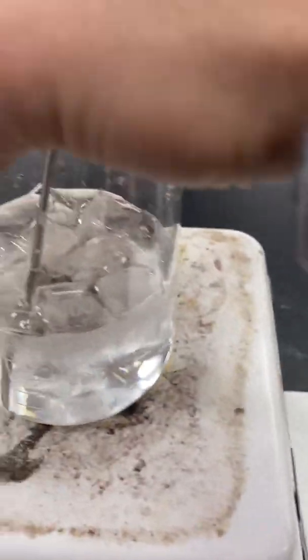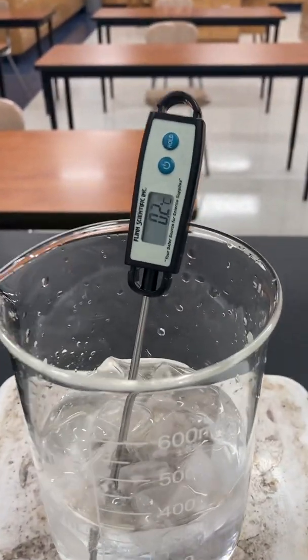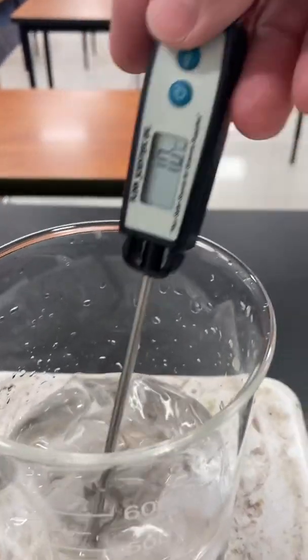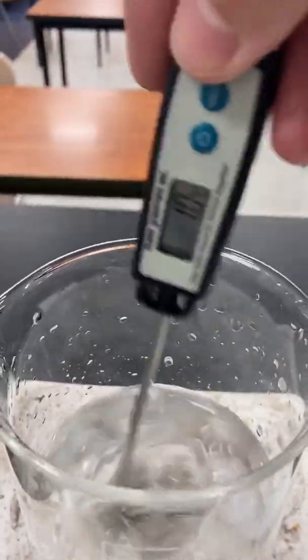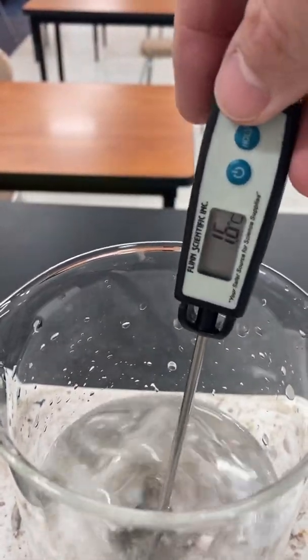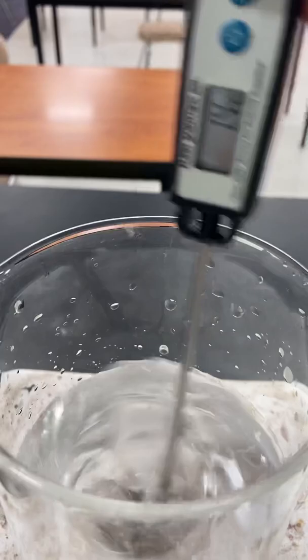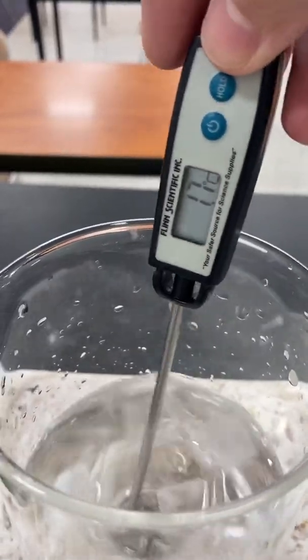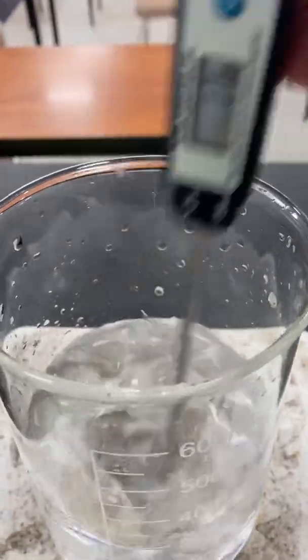So let's put this beaker of about 300 milliliters of ice water on, and the 300 is really not going to come into play today because we're not doing calculations. And let's see what happens. So at time 0, we had 0 degrees Celsius, and I'm just going to stir, and then about every 30 seconds, I'm going to do my second reading here in a second. I'm just stirring. Let's check out the temperature. And it looks like it's not even changing that much here.